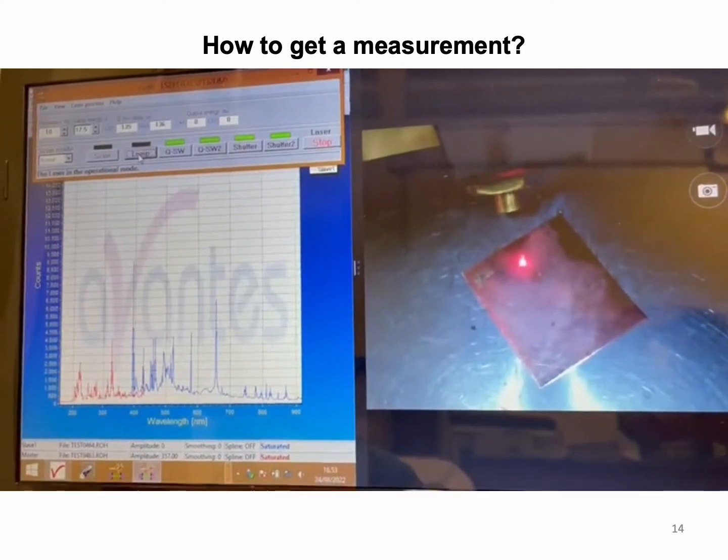For the acquisition, the spectrometer doesn't allow for a time gate lower than 2.5 milliseconds. Instead, the acquisition delay is set at 300 nanoseconds after the second pulse. When everything is set, we can start the measurements.